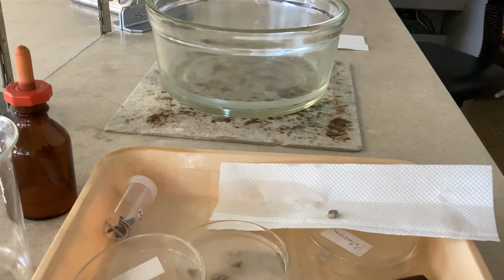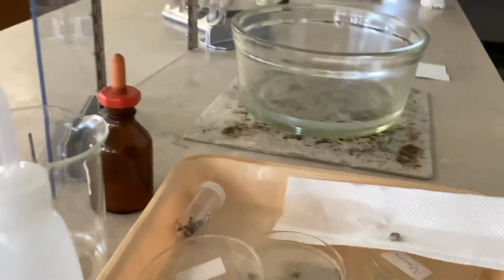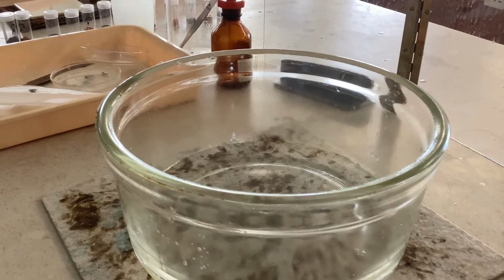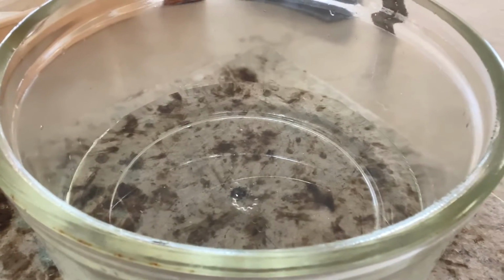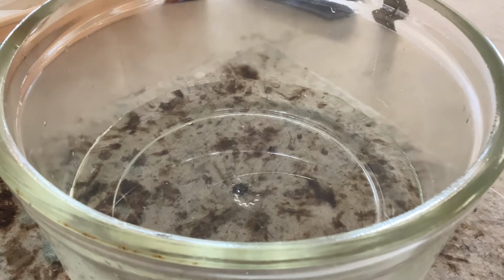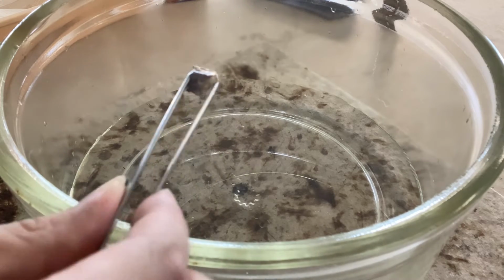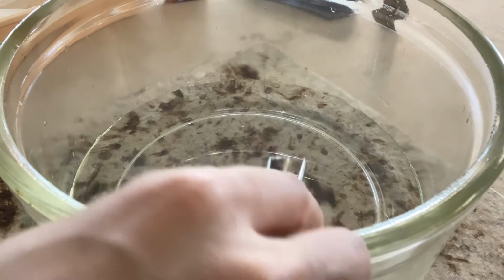And then can you see that there is a large tray of water here? Let's have a closer look. Originally, this sodium metal has an irregular shape, gray in color, and let's see what will happen if it is dropped into water.